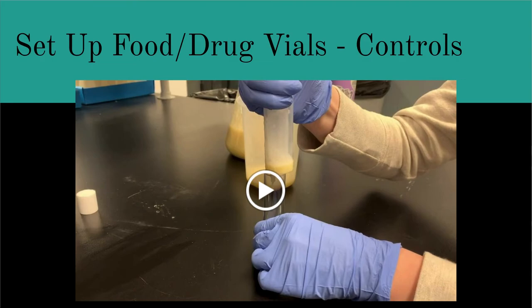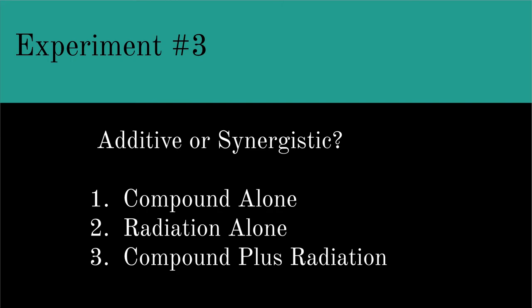Another option for this week, just as an idea, is you can perform a pretty simple experiment to determine whether the effect of your compound is additive or synergistic with radiation. In other words, does the compound by itself produce some effect? We're assuming that it does. Radiation alone is going to cause about 50% death. Right now, with the most updated information I have, it looks like our percent survival is about 47%, which is right on target for 2,500 rad.